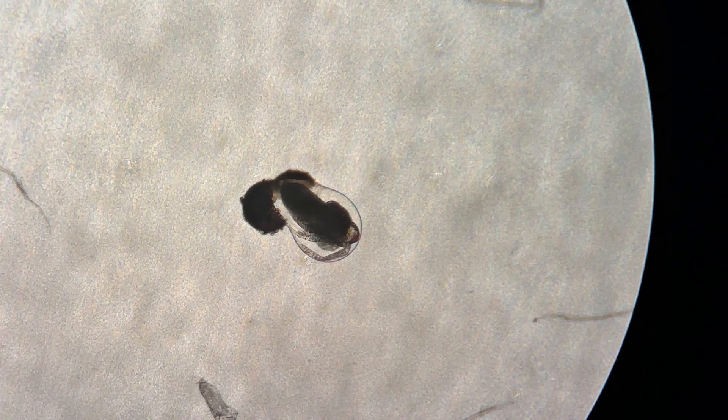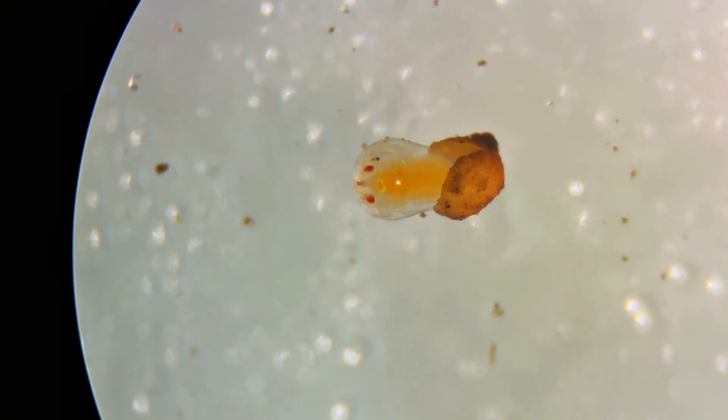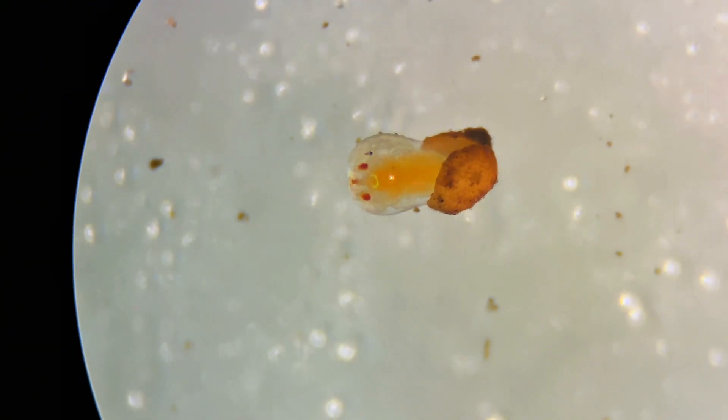At this point, they clearly have defined eyes, limbs, and other structures. In this specimen I'm working with, the eyes are currently red, but over the coming weeks they will darken and become even more distinct.